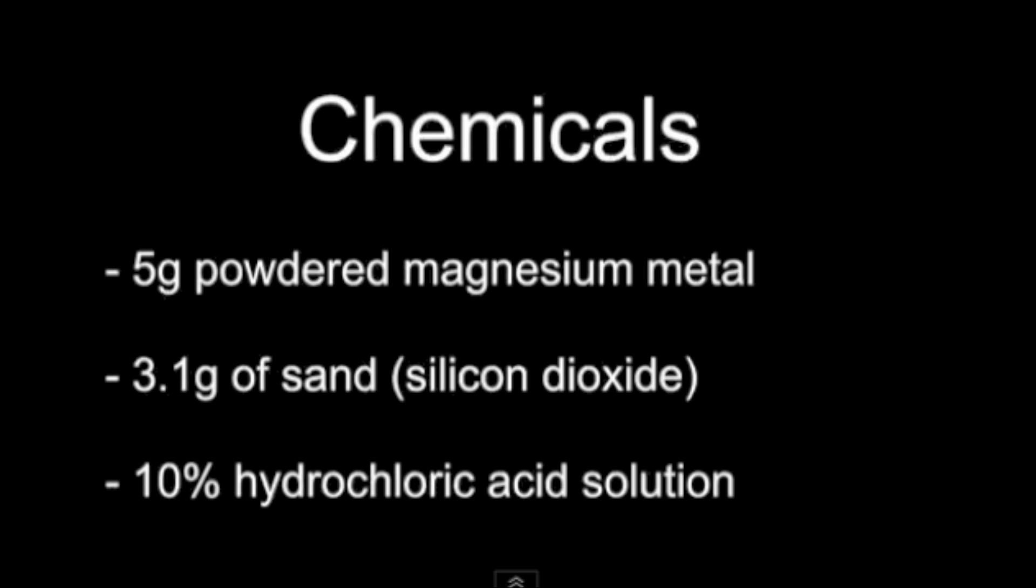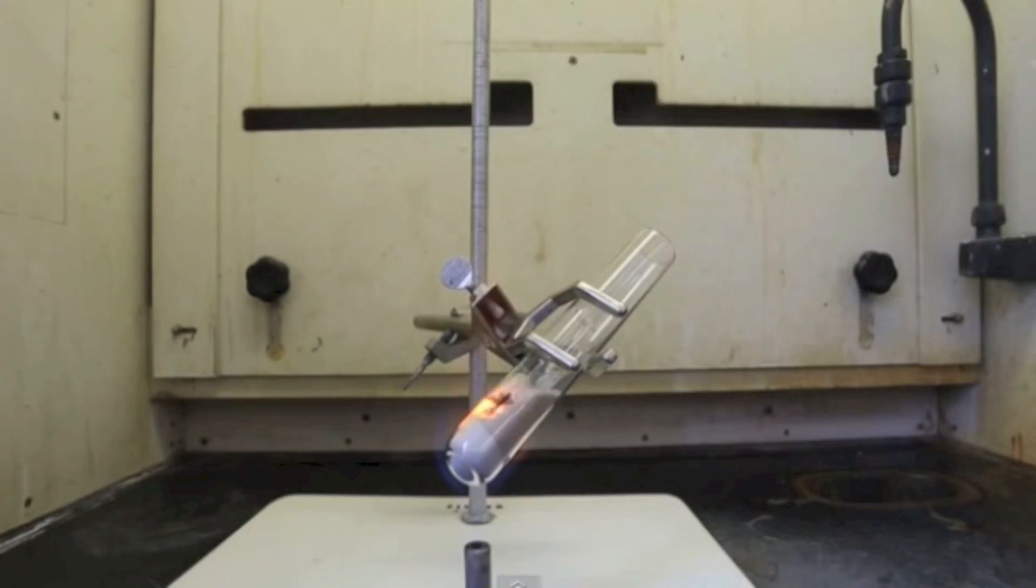The silicon then reacts with the excess hot magnesium to make magnesium silicide. In his procedure, an excess of magnesium was used to ensure that all of the silicon got converted to magnesium silicide.